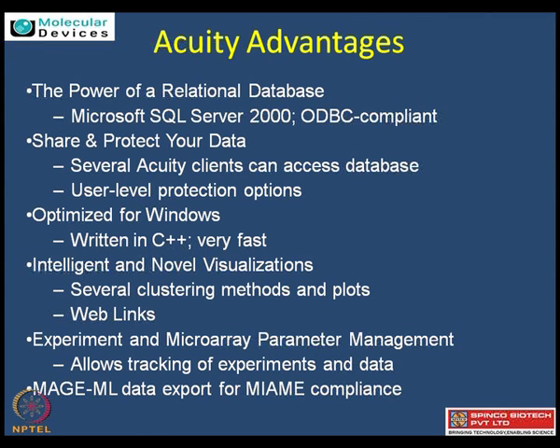So I guess the last 2 points which you mentioned, one is tracking the data based on the experiments, right? I think that's very important. That's also depending upon the need of the experiment. One needs to in fact track and make the software learn your experiment so that one can actually apply the same knowledge for the various slides throughout to track that data set. Yes. Now, the second point which you mentioned about MIAME compliance, I think that's very important because one needs to do all the quality control checks and overall data analysis with the uniform guidelines provided. So one has to adhere to those quality control checks.